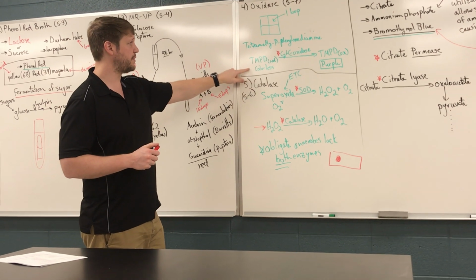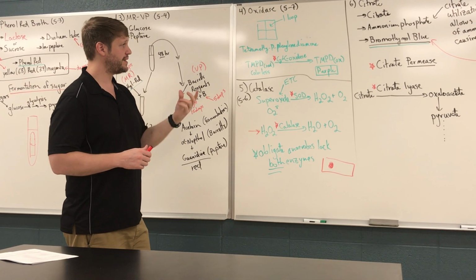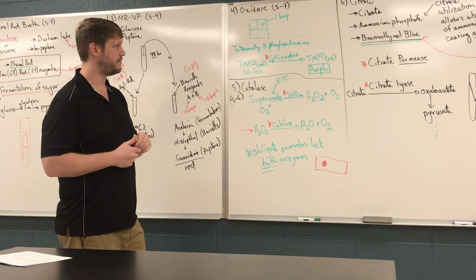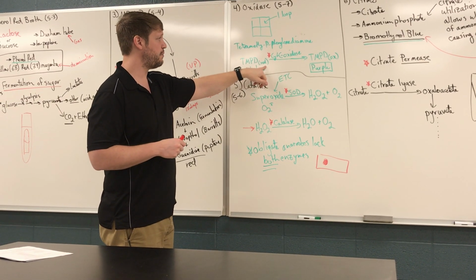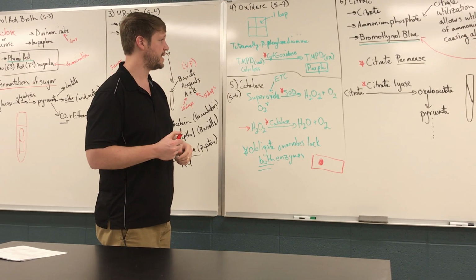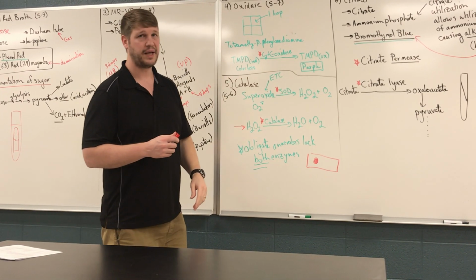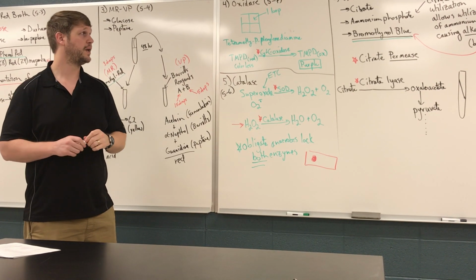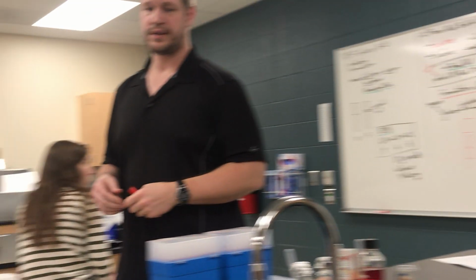We're testing for it using a reagent called tetramethyl-p-phenylenediamine. And this molecule is sensitive to the redox status of the cell broadly, but more specifically, it's capable of contributing electrons to the cytochrome C oxidase. And if it does, it will become oxidized and it will change from colorless to a purple color. So there are two different systems for doing this test.